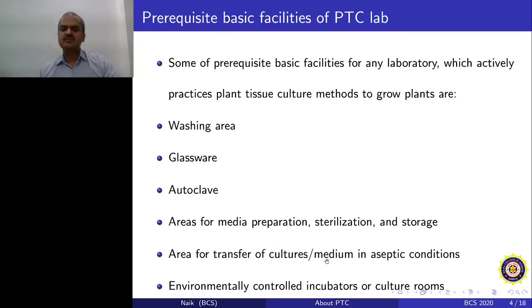Again, the area for transfer of cultures and media in aseptic condition. This is basically the laminar airflow hood.